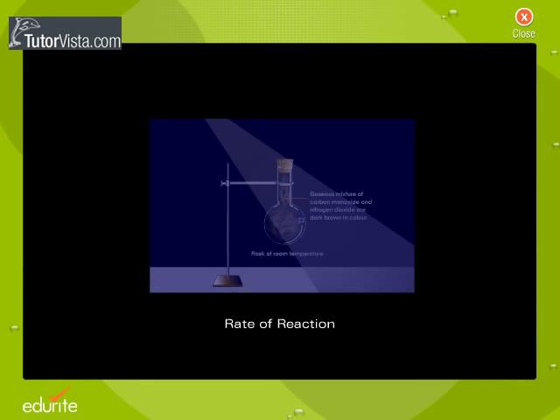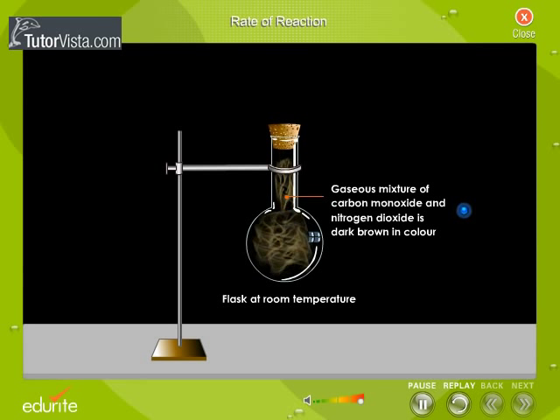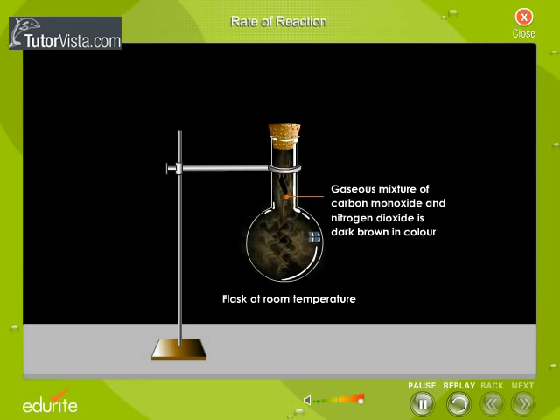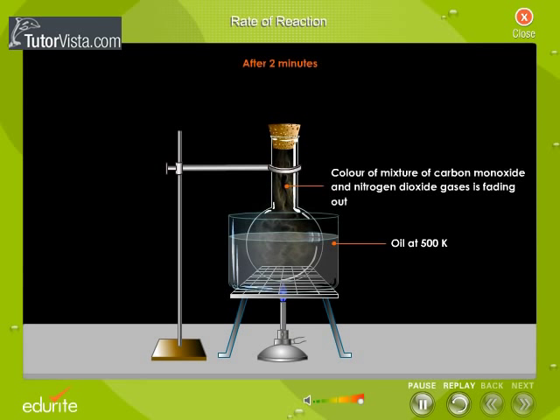Rate of Reaction. 0.1 mol each of carbon monoxide and nitrogen dioxide are taken in a 1 litre round bottom flask and the flask is stoppered. Observe the color of this gaseous mixture in the flask. Now place the flask in an oil bath heated to 500 Kelvin. Observe the change in color of the gaseous mixture after every two minutes.